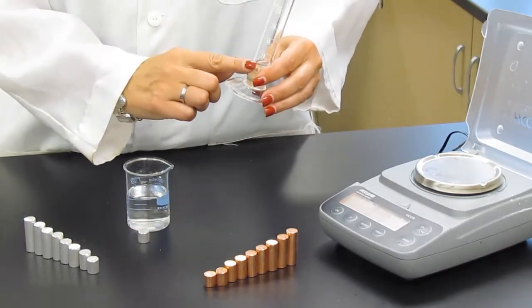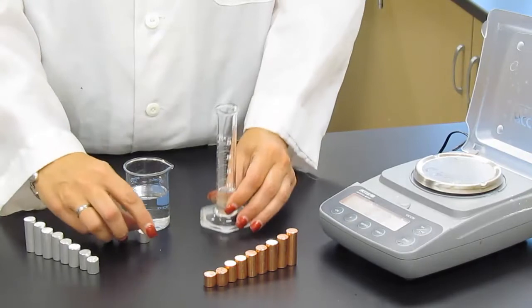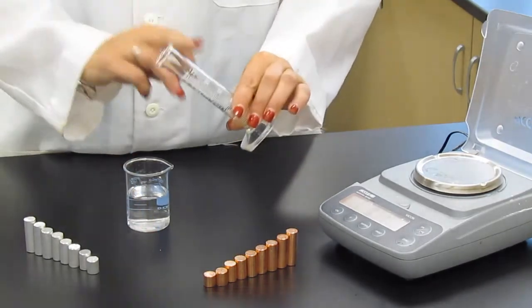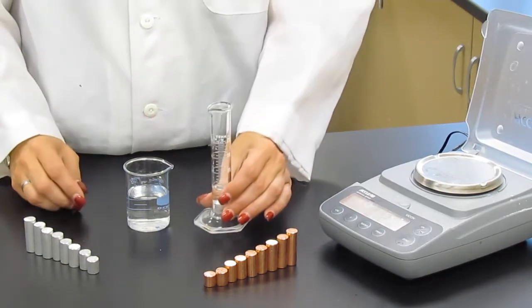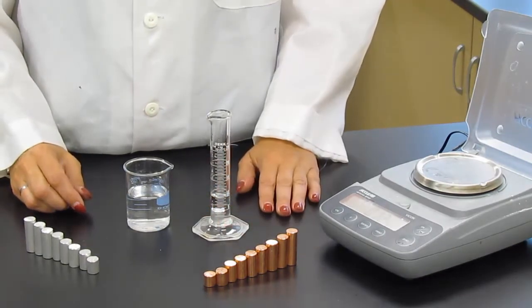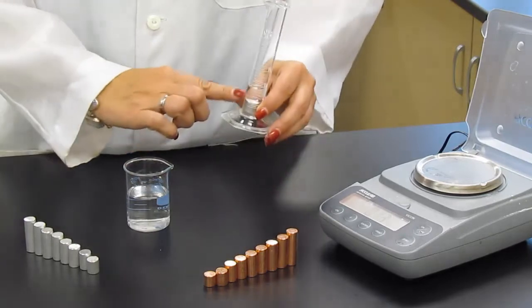Take a reading on your graduated cylinder. Make sure that you take it to the correct number of significant figures. Then carefully add your cylinder. It helps to tip the graduated cylinder on its side as you slide it in. Make sure no water spills out.